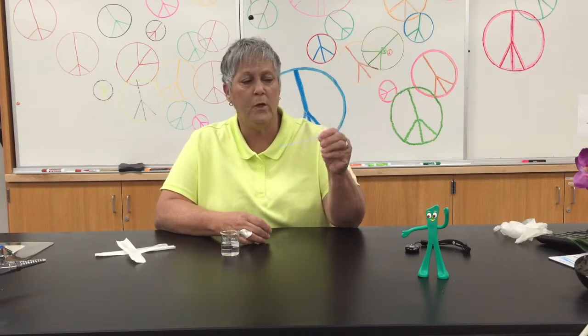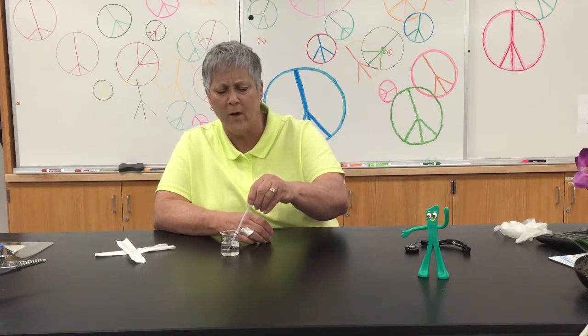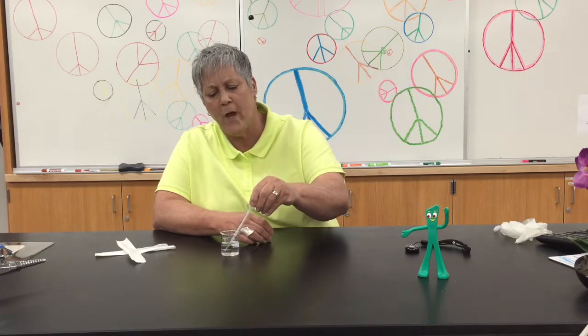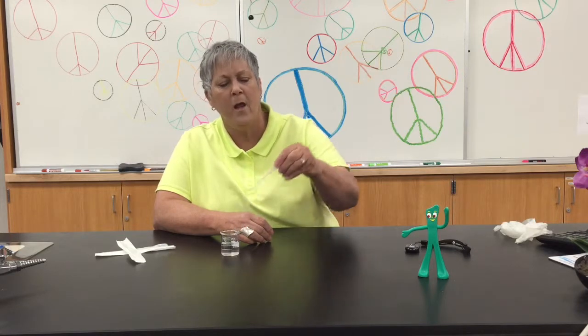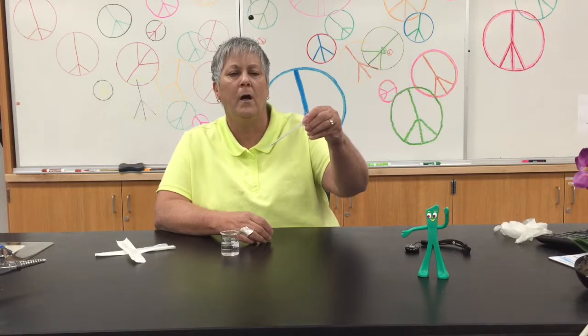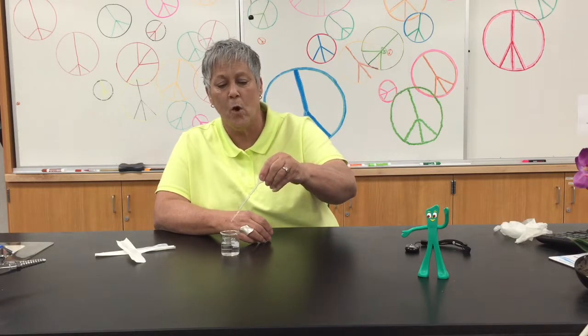So what you do is go ahead and give the bulb a squeeze, put it in the water or whatever — the oil — whatever you're trying to pipette, and just gently release the bulb, just slowly slowly. You can see the water moving up the pipette, and once I get to one mil I would pull it out of the water and then I can go ahead and dispense the water into whatever it was I wanted to dispense it in.